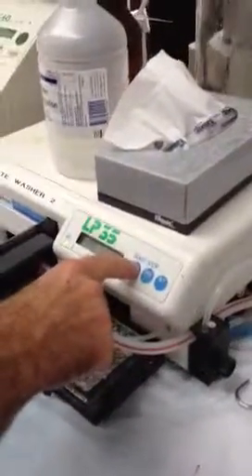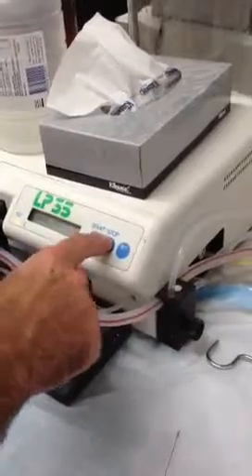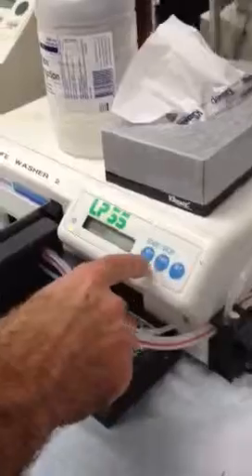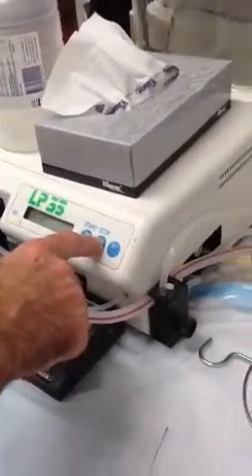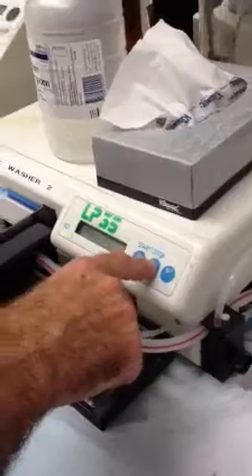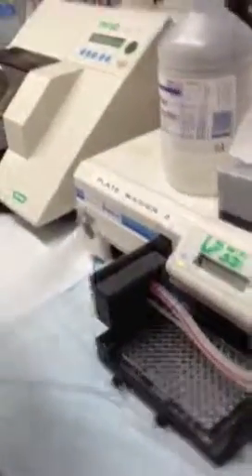There are only four choices: wash, wash parameters, rinse, and adjust. But basically you're only ever going to use rinse and wash. Adjust and wash parameters you'll use only when you want to set up a new assay or if the protocol you're using is not working.